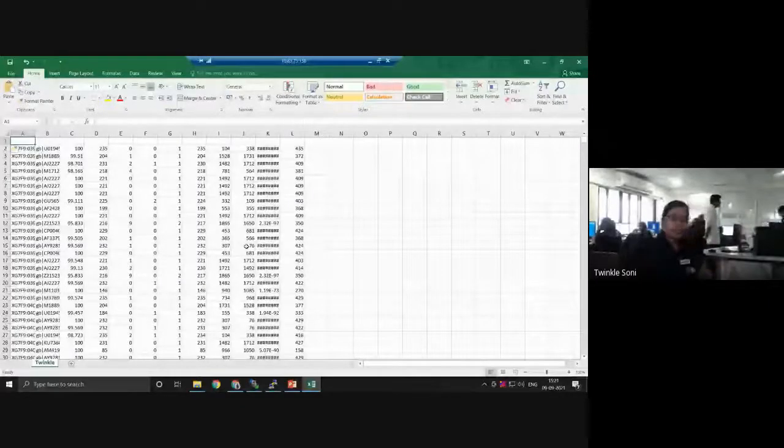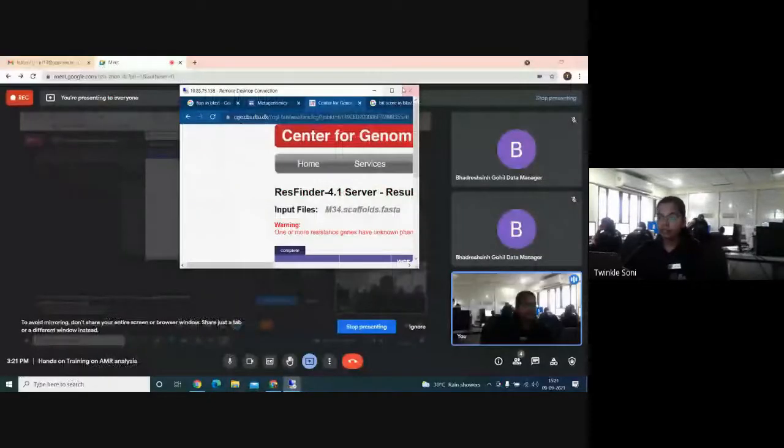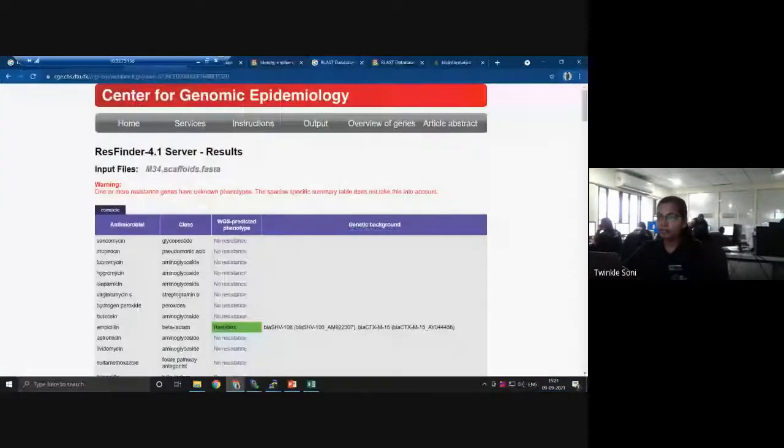At the topmost, insert a row over here for the headers. As it doesn't contain any header, we need to add one. You can literally Google it, because every time you do this, it will not show the headers.